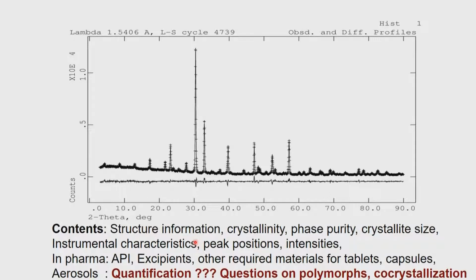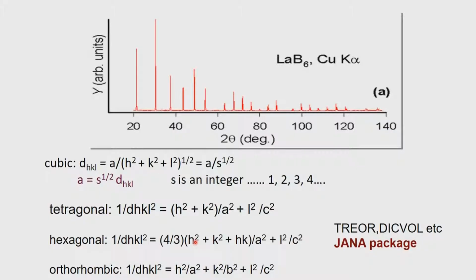Other than that, of course, all the information that is contained in a single crystal diffraction is available in this one dimensional profile of the powder. So, in some way or the other, this one dimension profile has to be broken down into 3-dimensional reciprocal lattice information. Once we do that, we can determine the structures even by using the single crystal approach. So, this is the basis of it. So, we will now go systematically through how we index a given pattern.